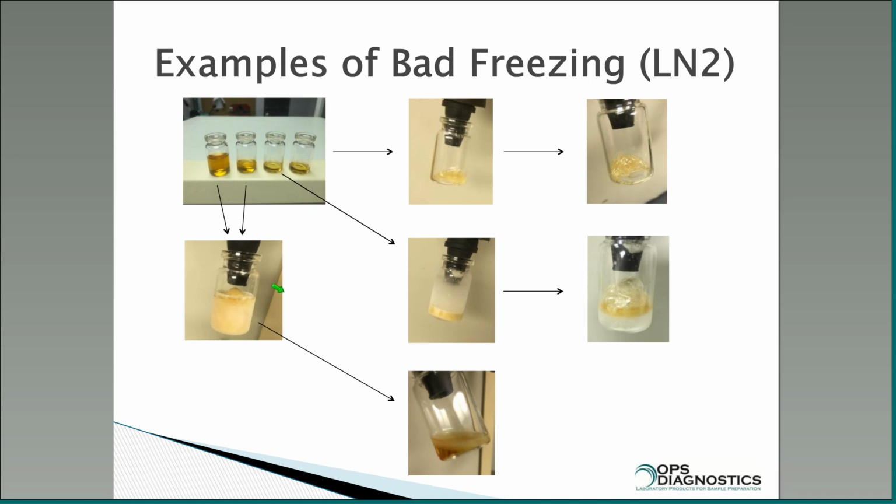And what you get is that initially when you turn it on and you don't freeze your sample, some people will suggest, well, you just put it on there and turn it on and you'll pull a vacuum and it will freeze your sample right off. And that's not necessarily true. What happens is you'll see a lot of bubbling and then it will calm down and you'll end up with liquid in there, and over time that will dry into a flat crust on the surface of your vial. That's dried. It's not freeze dried, that's just dried.